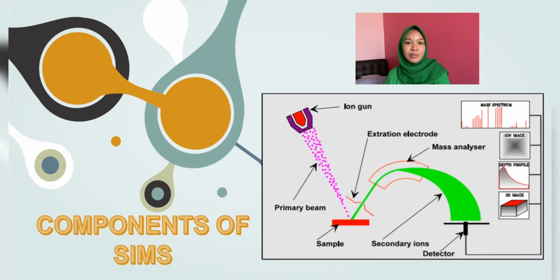So this is a block diagram of the SIMS technique. Most of these instruments are characterized by a surface region in which the intensity, energy, and orientation of the primary beam are controlled. Ions generated by this process form the secondary beam and are subsequently transmitted within a continuous high vacuum environment to a mass spectrometer.